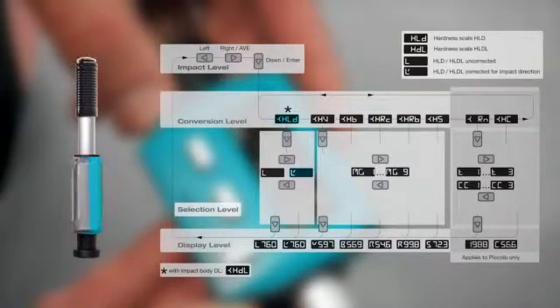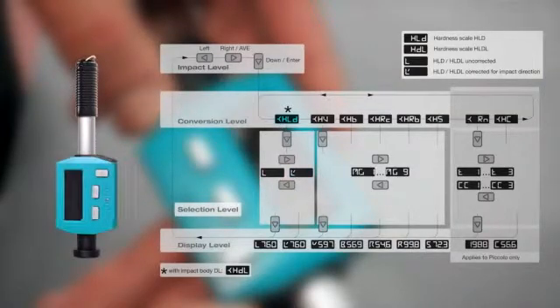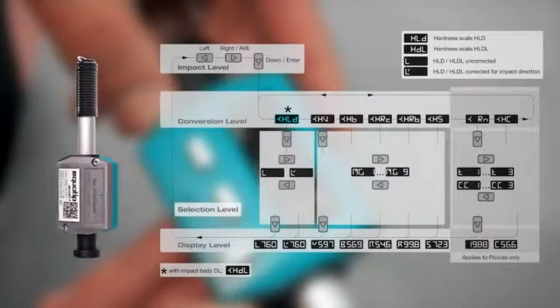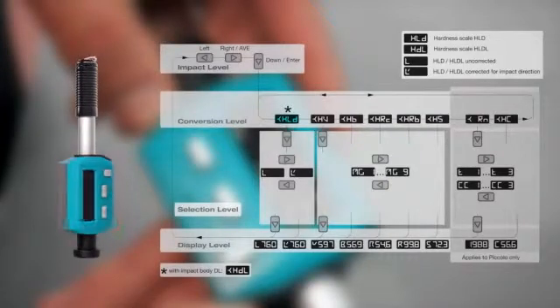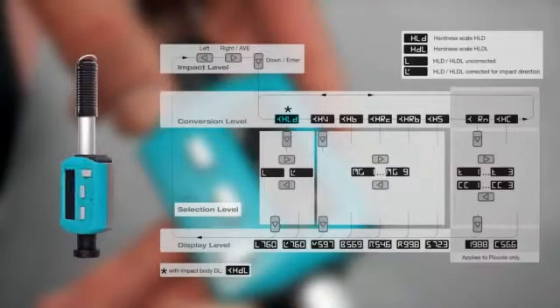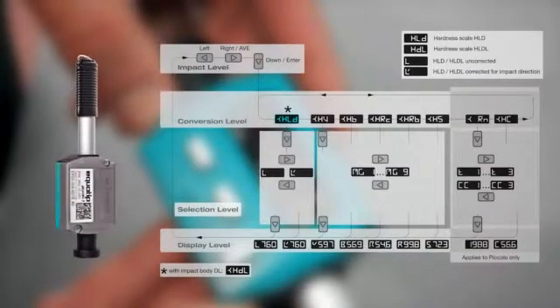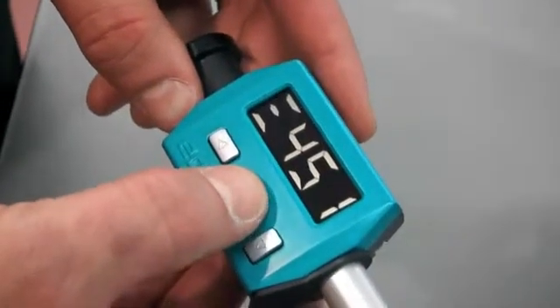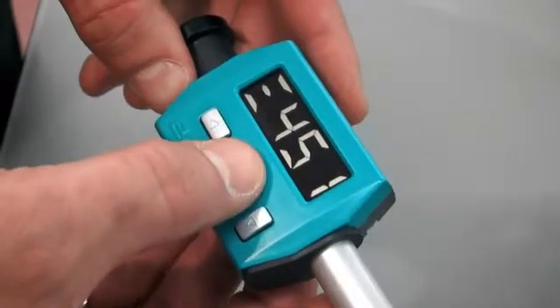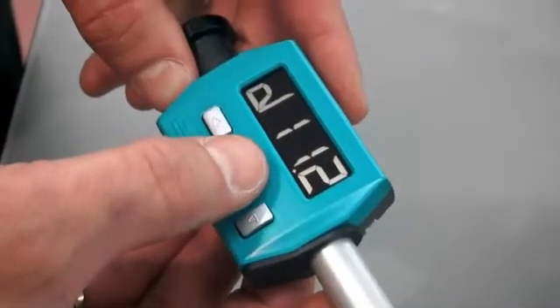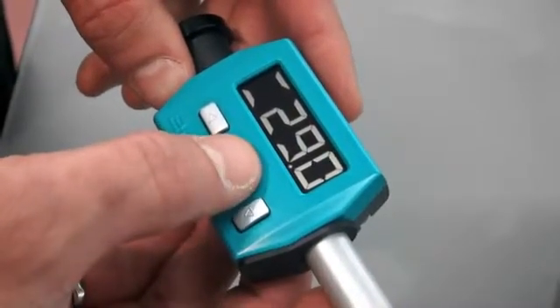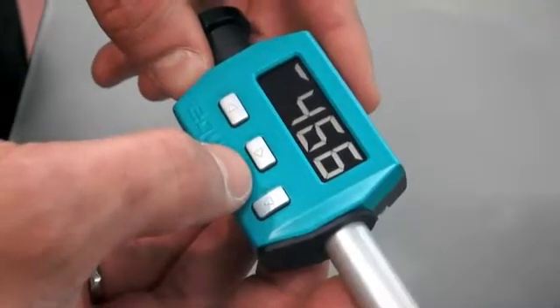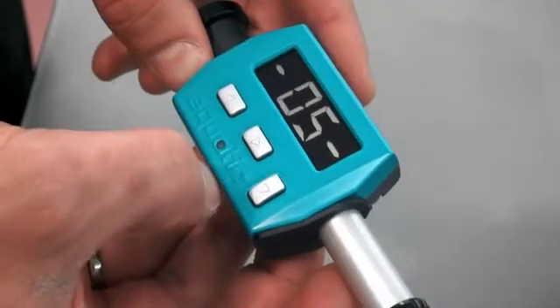Most measurements with the EchoTip Piccolo are performed in the average mode. This means that a series of impacts is performed and the instrument displays the average value of these impacts when completed. To enter the average mode, press the right button. If you need to delete a measurement during a series, press the left key. After the needed number of measurements, press the right key. The display shows average, standard deviation, range, minimum, maximum, and other measurement parameters.